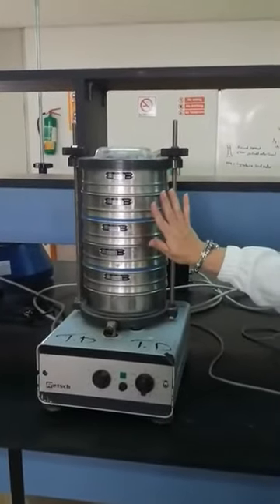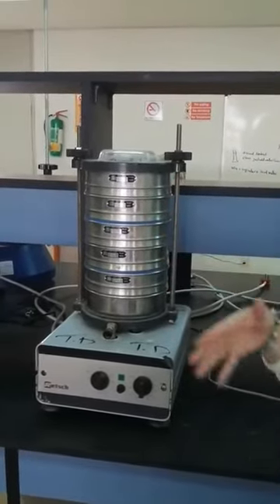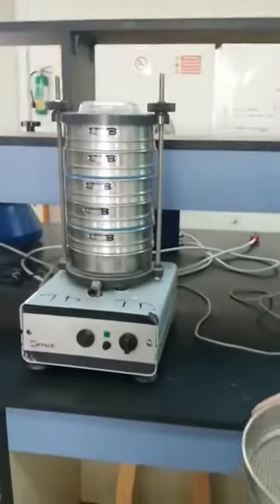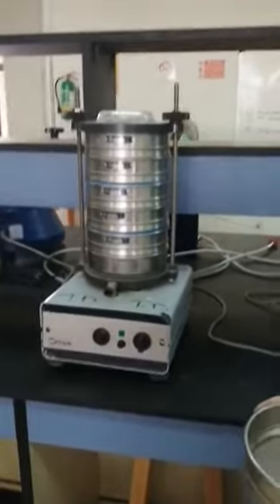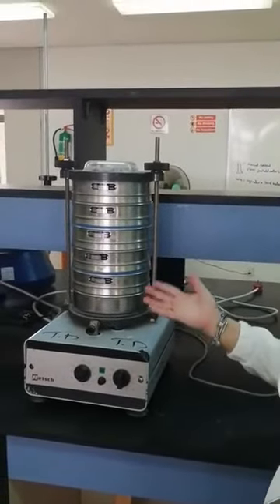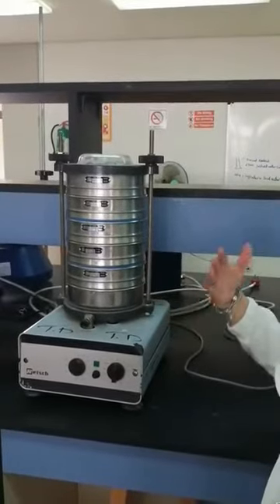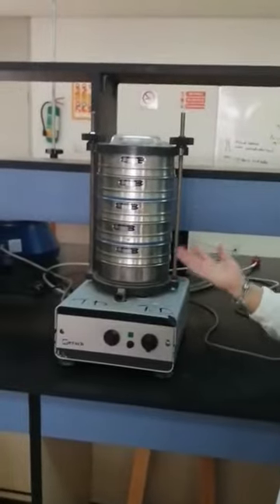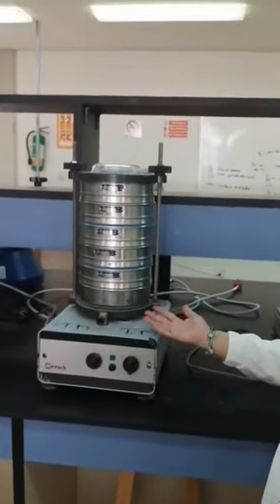After the sieving time, we take each sieve and weigh the powder inside, and we make a draw to make a distribution of that sample to see what is the mean, what is the mode, what is the average size or surface area of our particles.